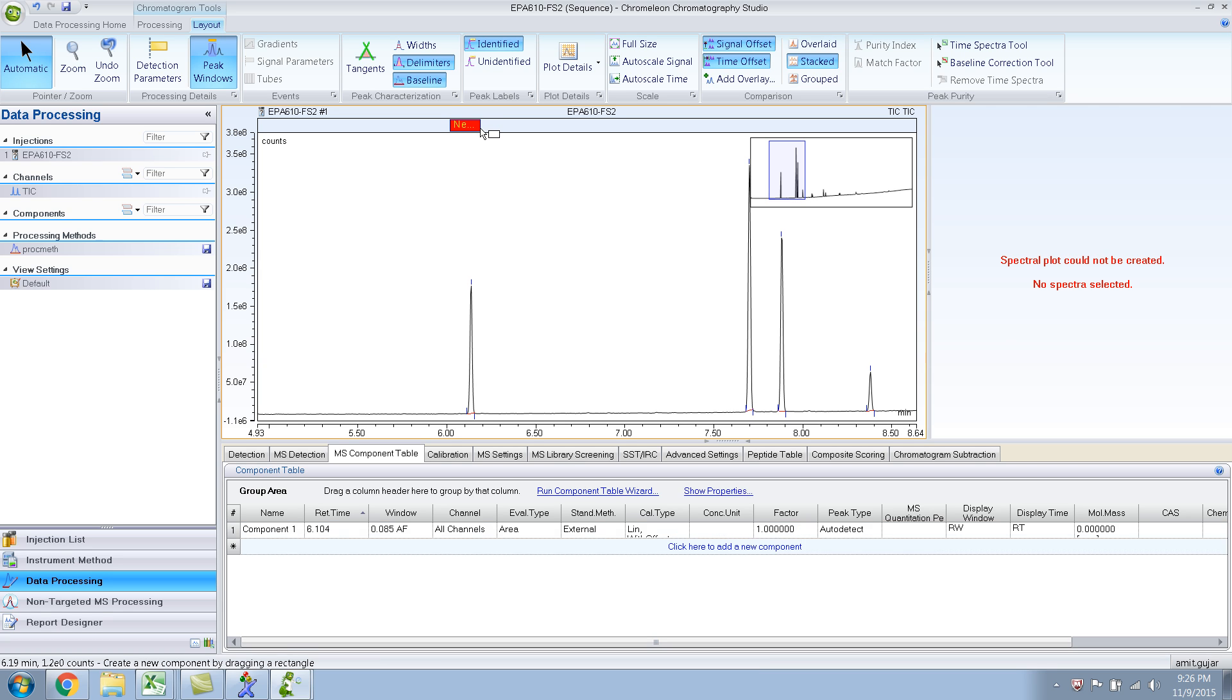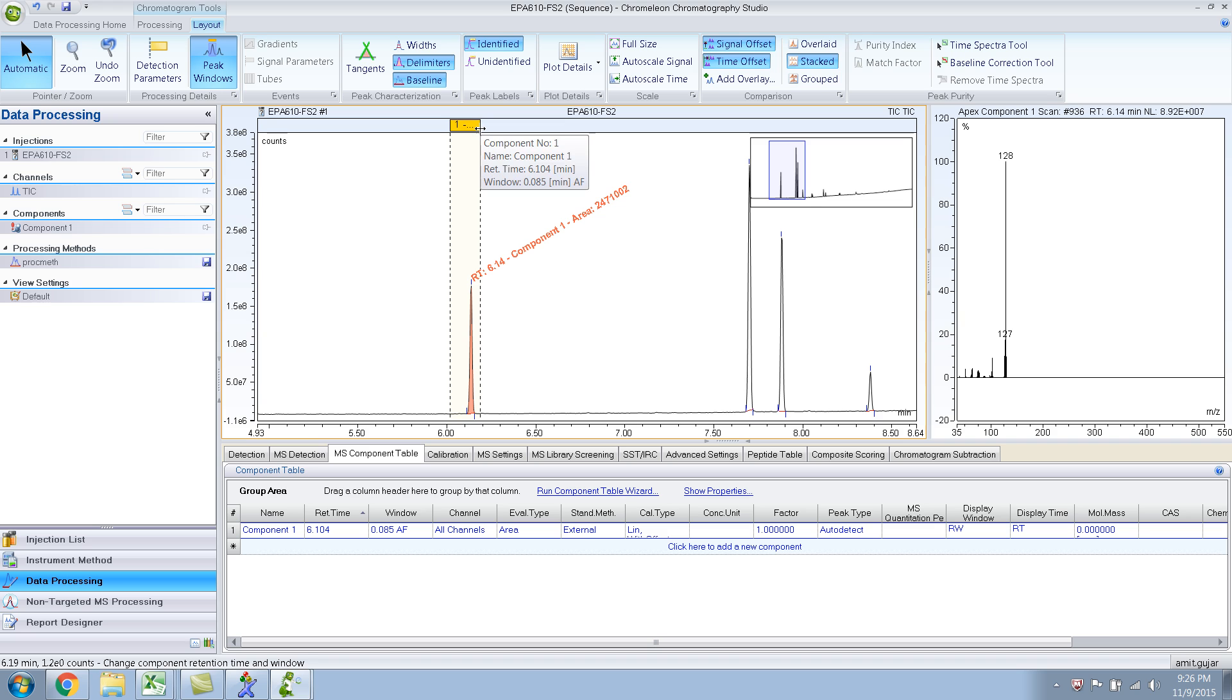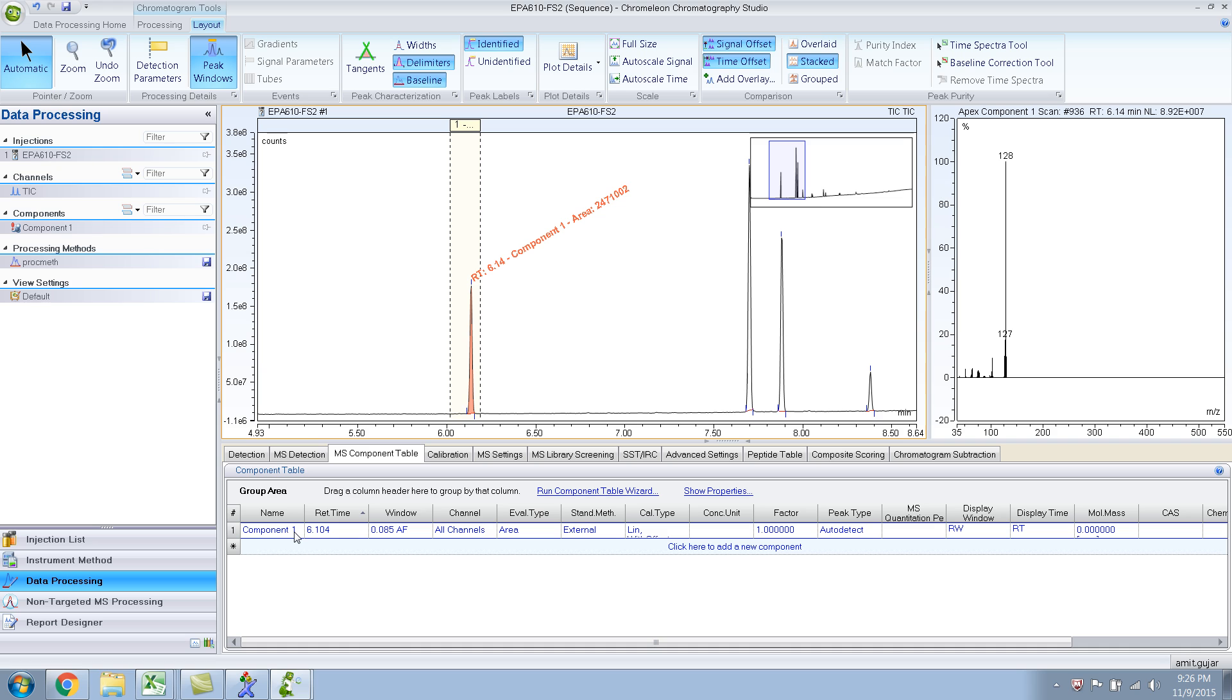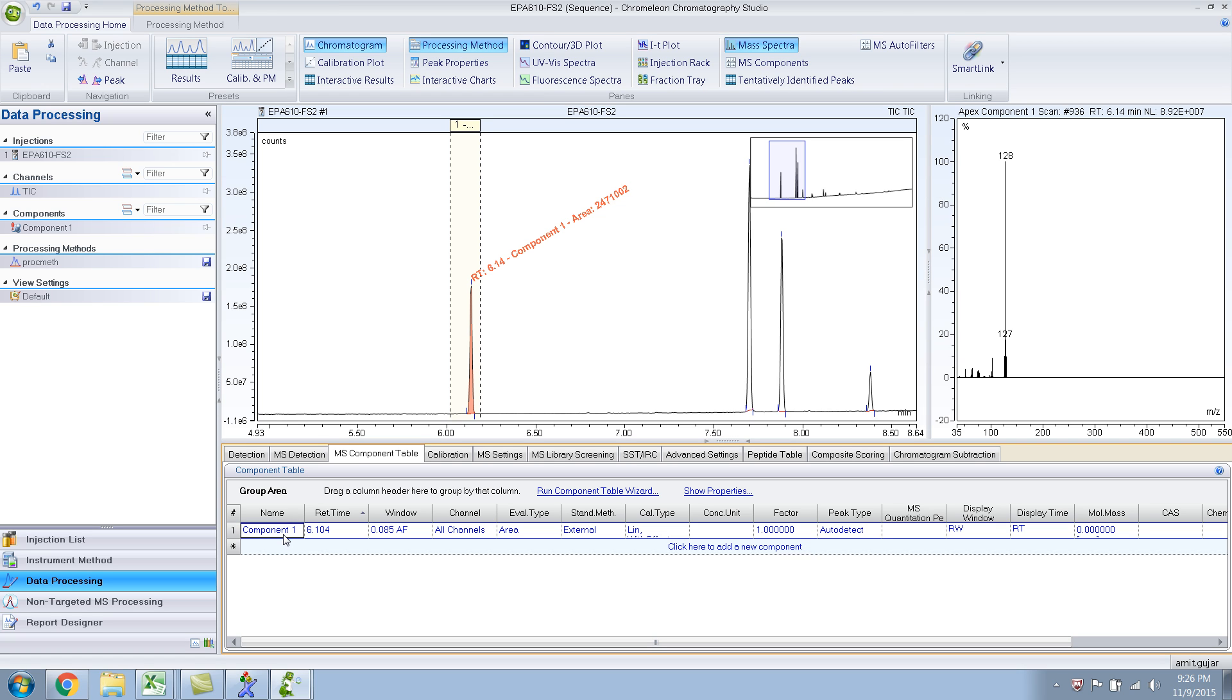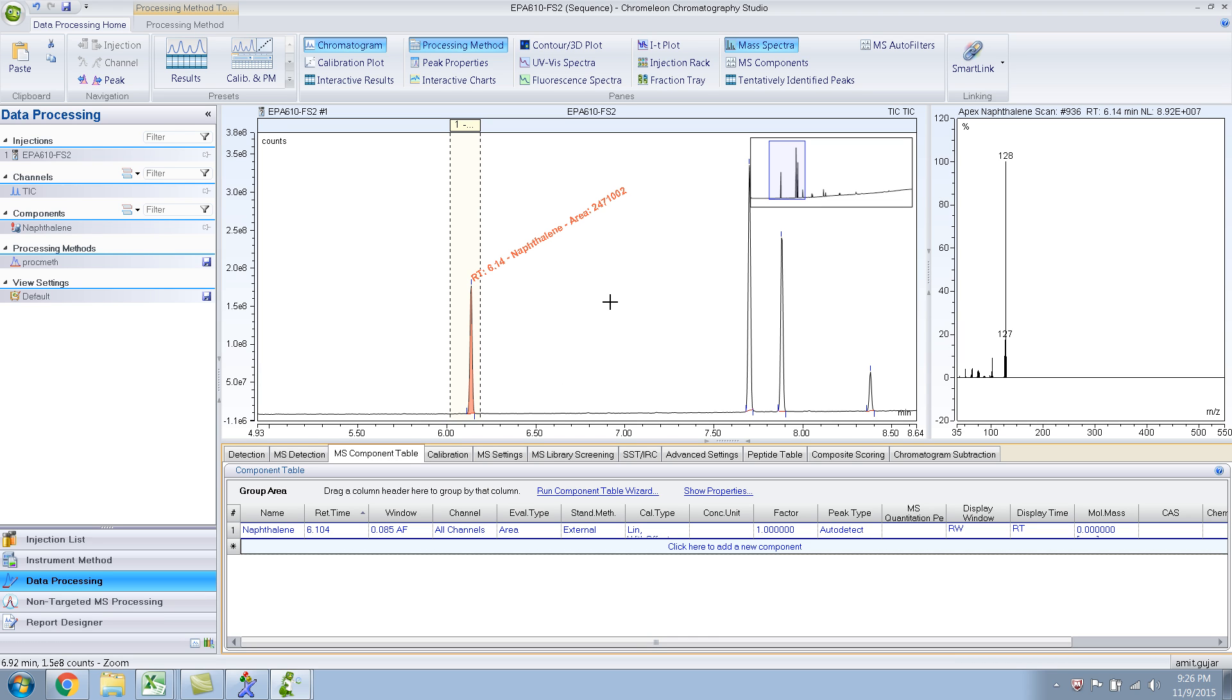So when you drag it, it automatically creates the compound in the MS component table for you. So obviously it has not named it because it doesn't know what it is, but it has automatically taken the retention time and the window for you. So this is a slightly easier way of doing things, even though you still have to type in the compound name. And press enter, and there you go.